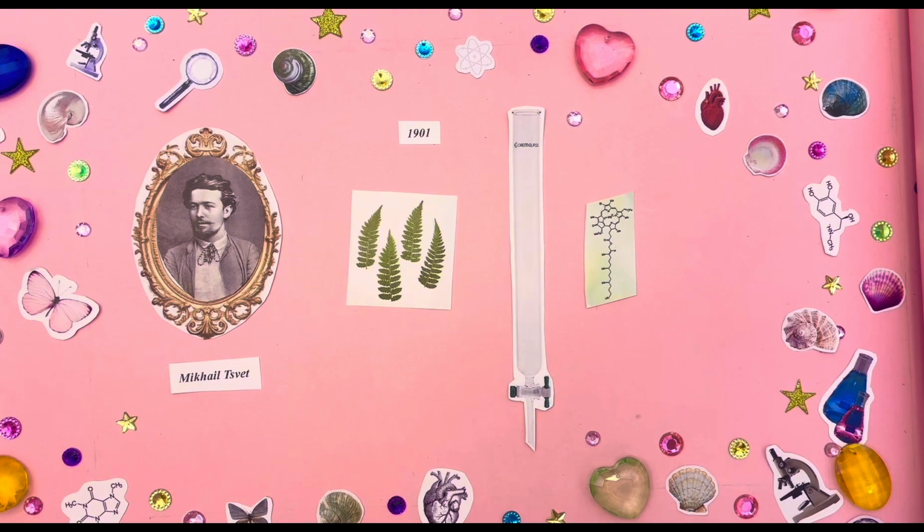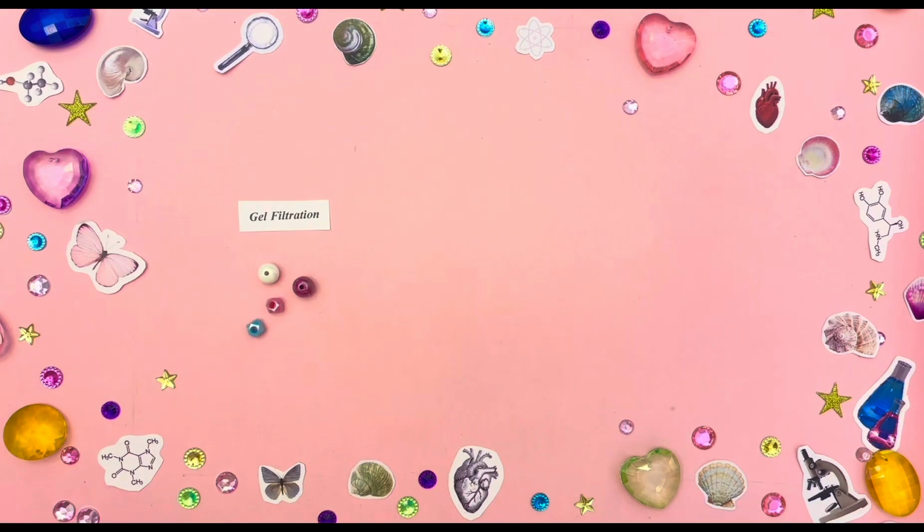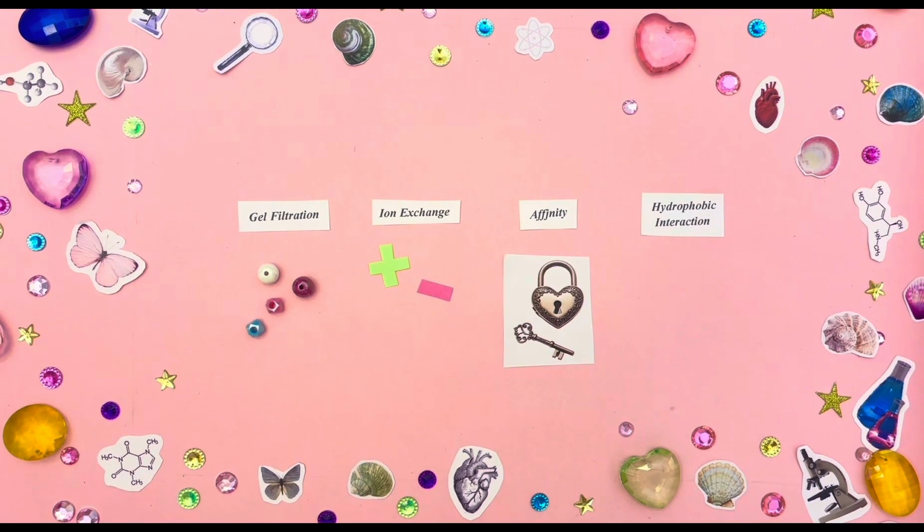He didn't know it then, but his methods, which didn't catch on until much later in the century, would evolve into 4 incredibly powerful derivations that could separate molecules based on size, charge, affinity to specific ligands, and surface hydrophobicity.